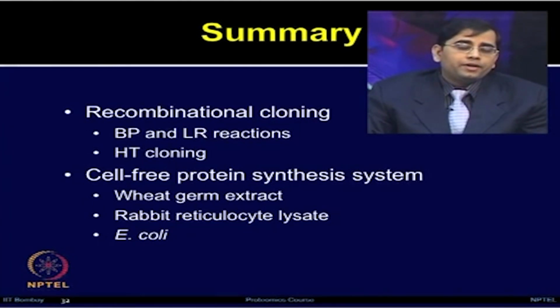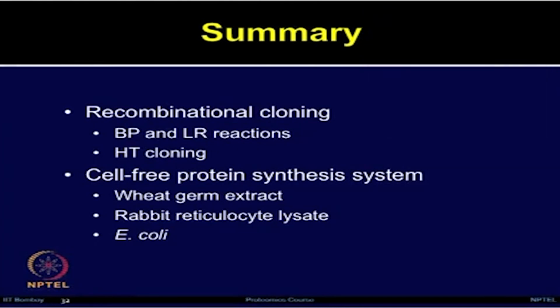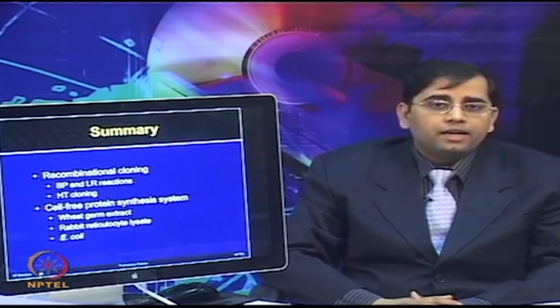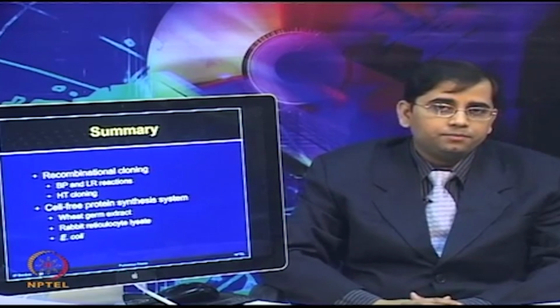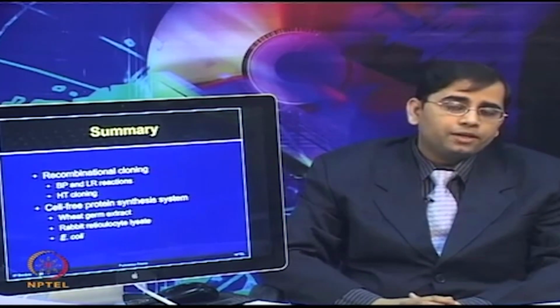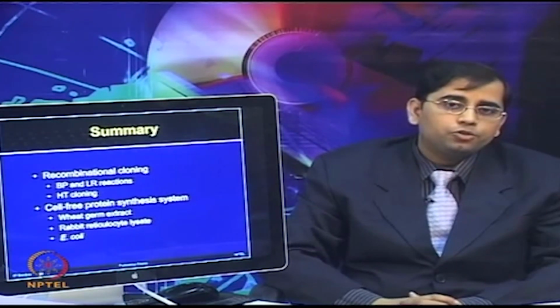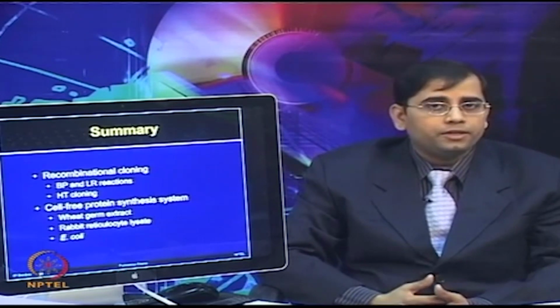The concept of protein microarrays has stirred a great deal of excitement in the proteomics community. Once the technology is fully realized, it promises to enable the study of a broad variety of protein features at an unprecedented pace and scale. However, generating protein contents in a high throughput manner remains challenging. Therefore, the recombinational cloning to produce clone repository and cell-free expression systems to produce proteins becomes very important.